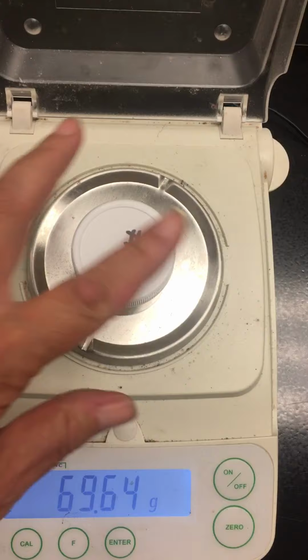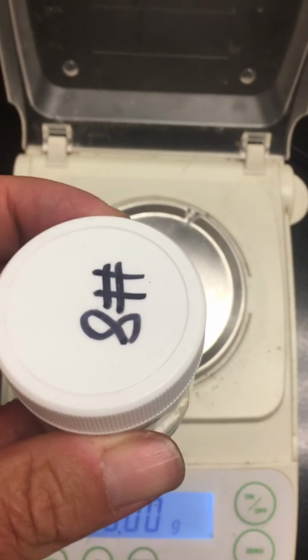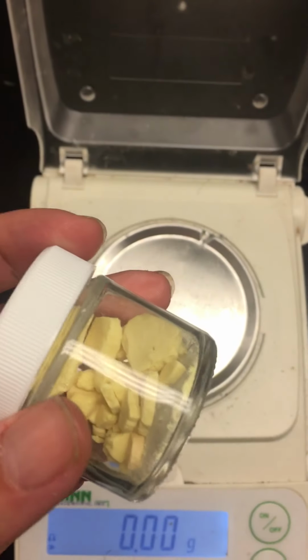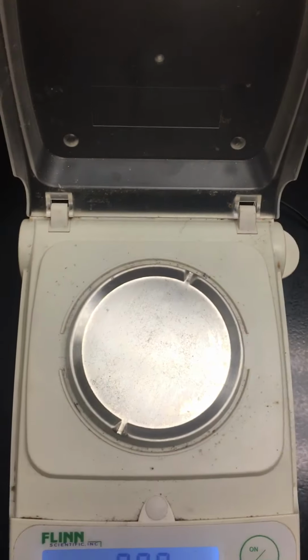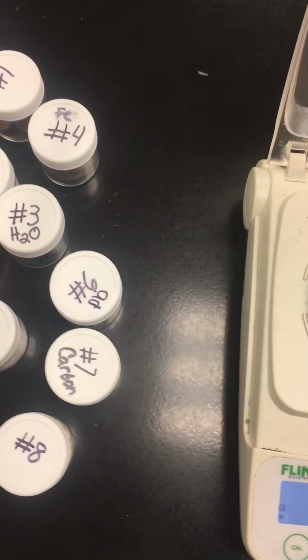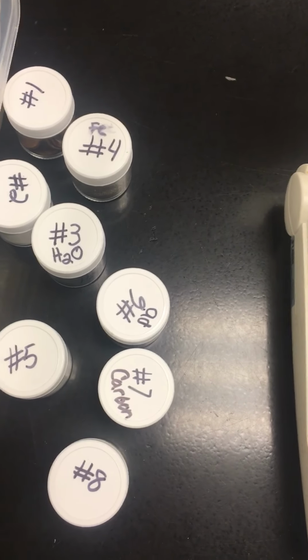Now, all these masses are the mass of the substance plus the bottle and the lid. You need to subtract that. You need to measure by differences for this lab, and then you will have the mass of your substance. That is to be transferred down to your data table number 2, where it says mass of the substance, and then you will calculate the information from there.